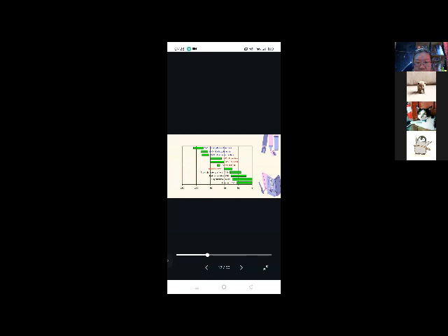For the green carbon, it is a CH bonded to CH2 and then OH, so the range is from 50 to 70. The pink one is bonded to CH3, so the chemical shift range is from 0 to 50. And this is a visual representation of the table to make it easier for you to understand. Each group has a different shift range.